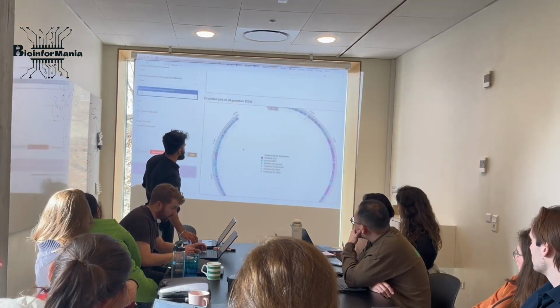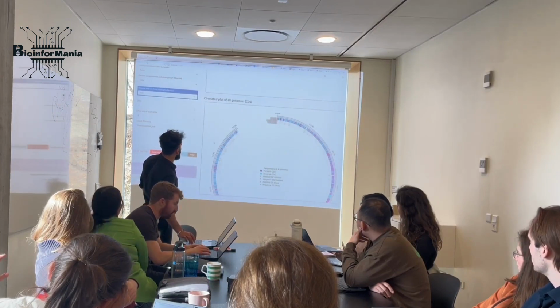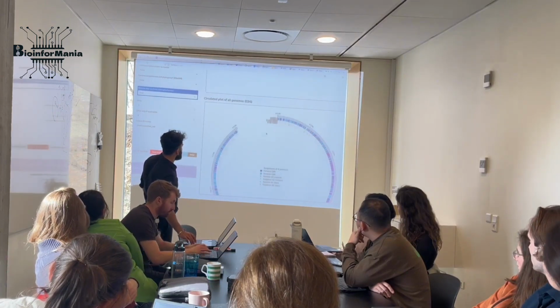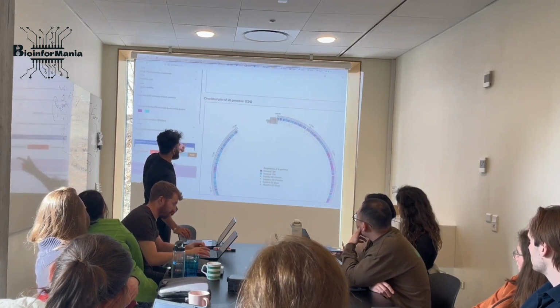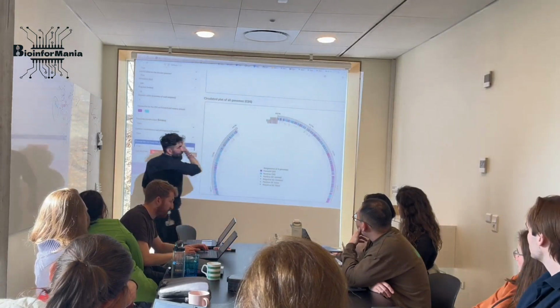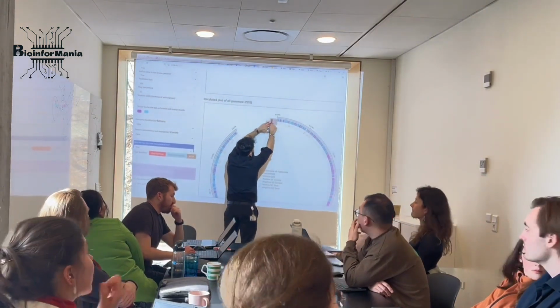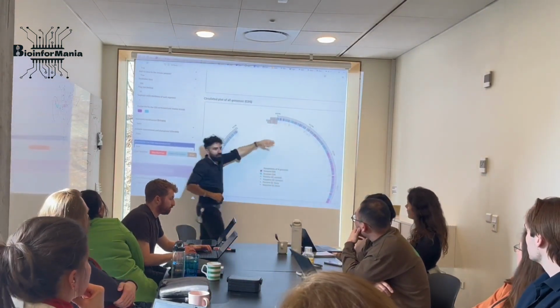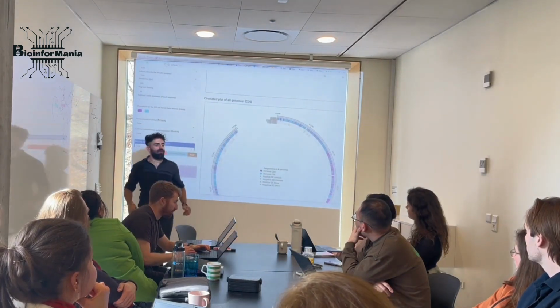This is for comparative genomics that creates this beautiful pangenomics circular plot, but it's very messy because right now I have how many? 8, probably 9, whatever. Oh, sorry, now actually this is my genome. These are the GC content. 1, 2, 3, 4. I have only 4 genomes. I have plenty of space. Let's make it a little bit bigger to see how it looks.